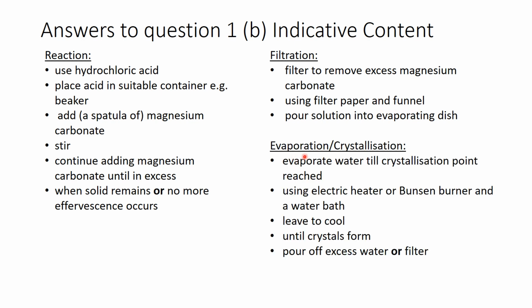Evaporation and crystallization. You need to evaporate the water until it crystallizes. You could use an electric heater or you could use a water bath. In the video that I showed you, we talked about using a water bath. You'd need to leave it to cool so that crystals form.